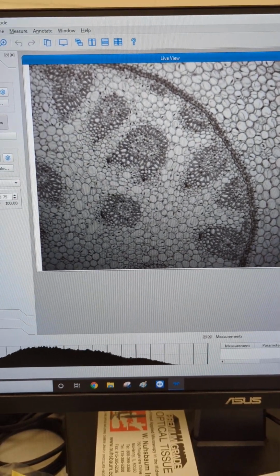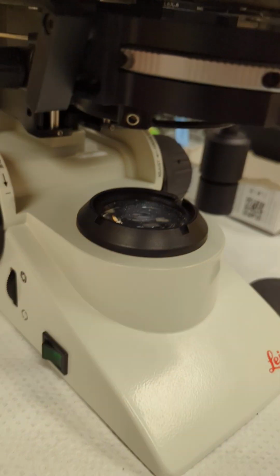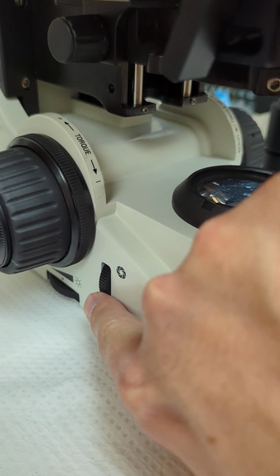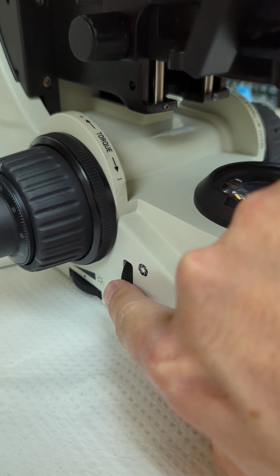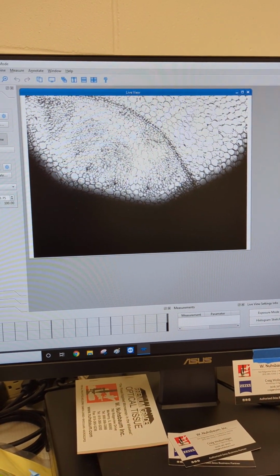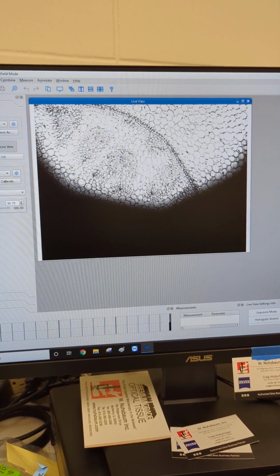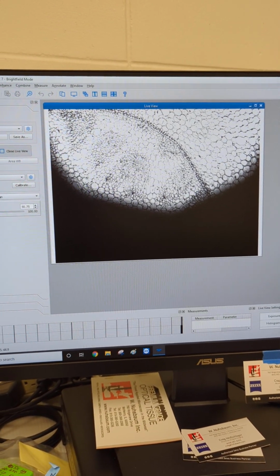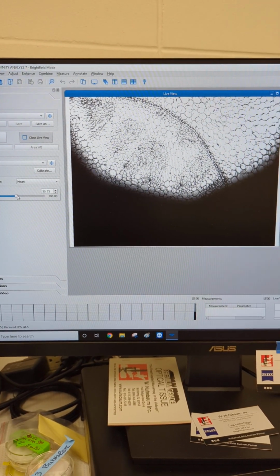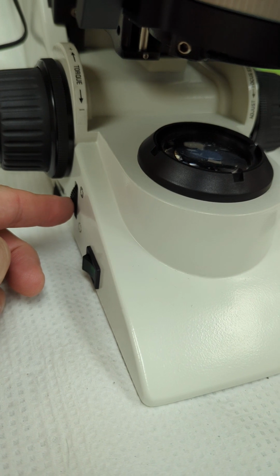and now I want to close the field aperture, which again is this one here, down here. And I'm going to close that down all the way. And you can start to see as I'm closing it, this is what's happening. Opening and closing. And I can see that the light's not centered, right? So this should be either a centered piece or filling the whole field of view with light. So this is with the aperture, again, the field diaphragm closed completely.